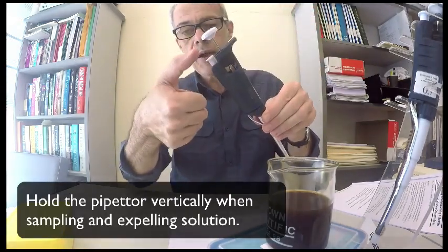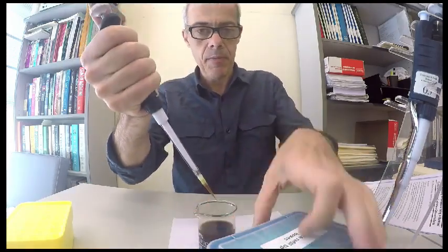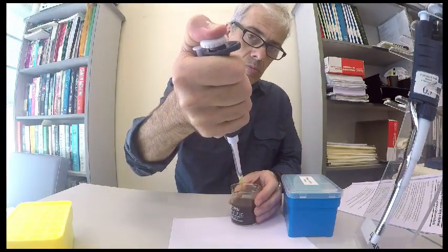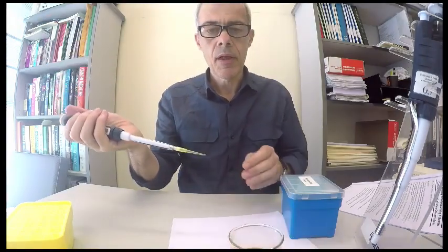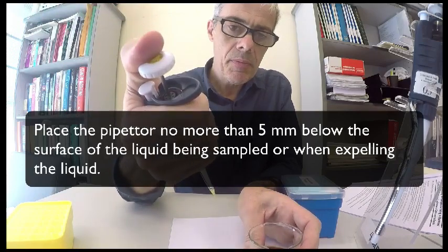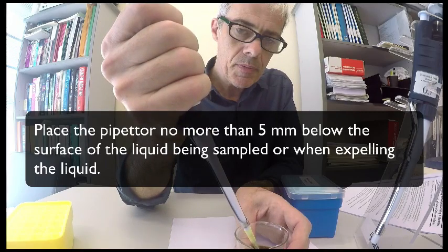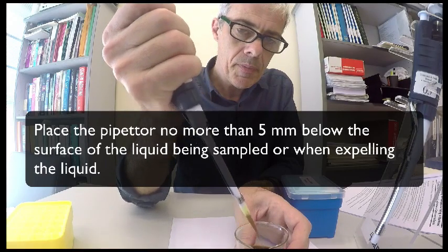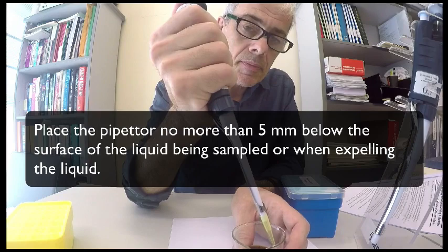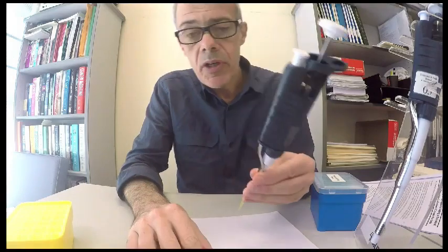To dispense it, I go down all the way to the second position. So I dispense it by going like this. So you'll see here, go. So to summarize, to draw up solution, you go down to the first stop, you immerse the tip, you draw it up slowly, and there's your 200 or 180 microliters, and then you can dispense the solution, okay?